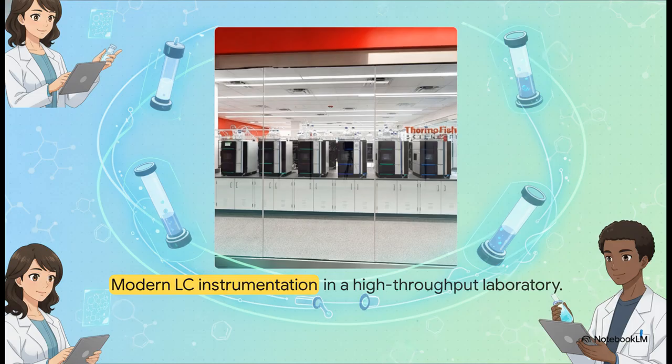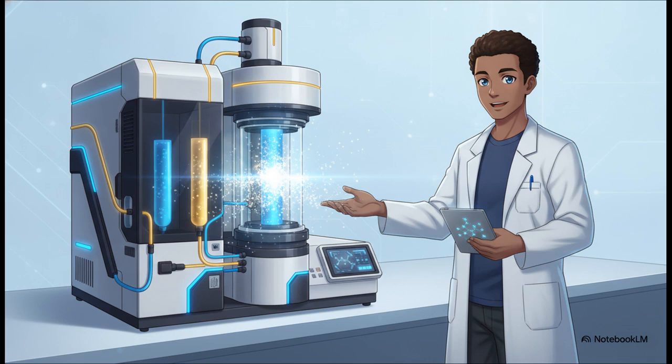You leverage the exact same standard high-pressure liquid chromatography arrays you already have on your bench. You're just swapping in a distinct set of columns and solvents perfectly tailored for the polar stuff. Just to rattle through the standard hardware, you've got your solvent reservoir and degasser, the high-pressure pump, an injector or autosampler, the HILIC column sitting in its temperature-controlled oven, and your detectors.